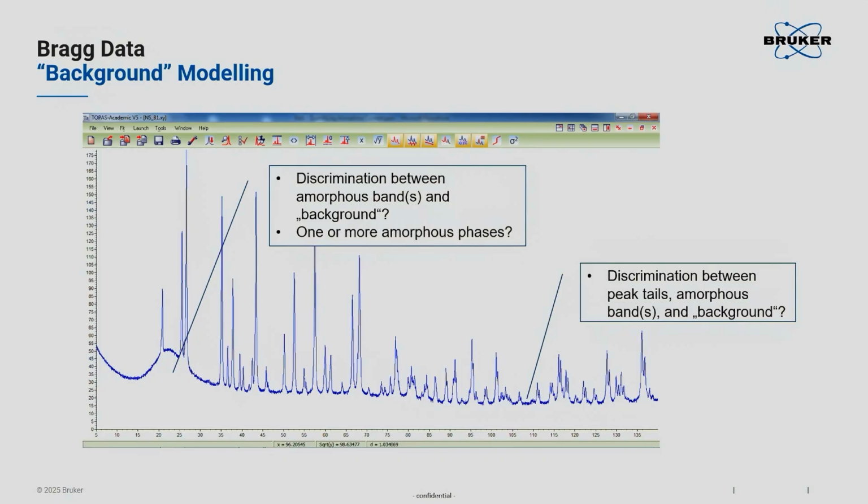There is equally no hope to do an accurate background for a pattern like that. And it is certainly not horizontal or constant as in the previous example. So what could we do? Any ideas? What could we do to maybe get a better idea of what the background, or rather the components of the background are? Remember what background components you could have.